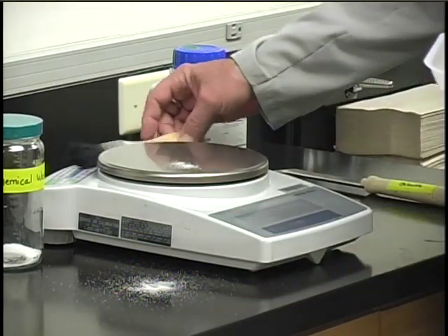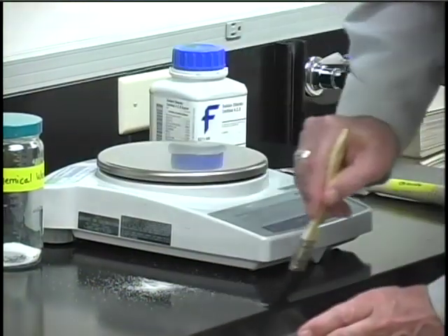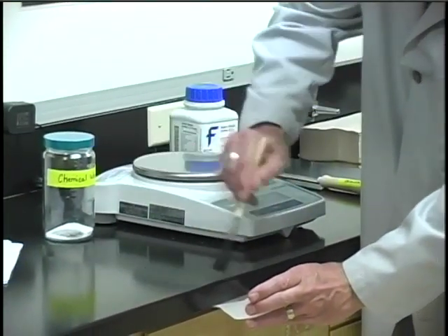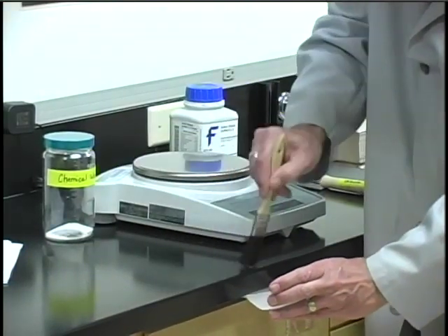For a solid spill, we have some brushes on the balance. Just get yourself an empty weighing boat and use the brush to sweep up the chemical. If you're not sure how to clean up a spill, check with your instructor and he or she will tell you how to do it or help you.